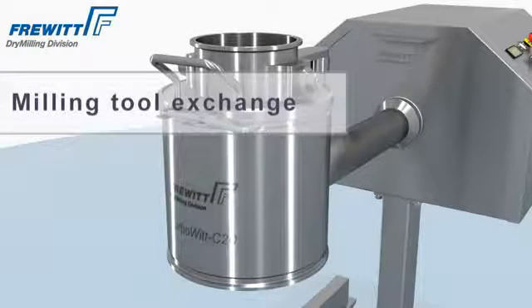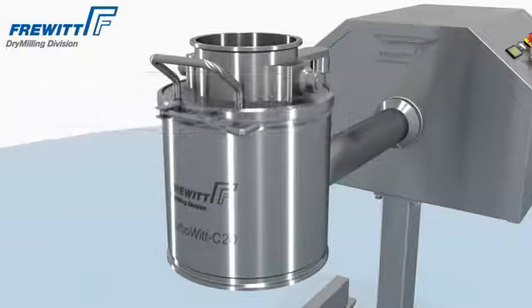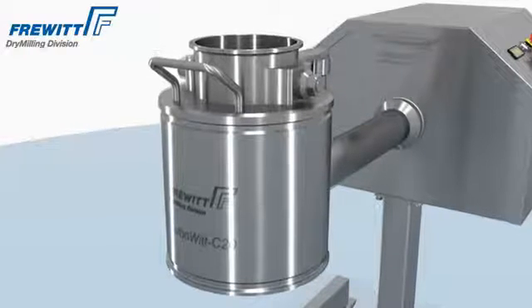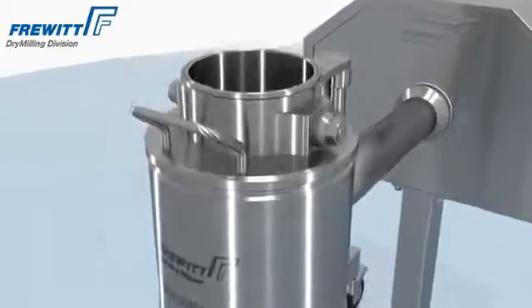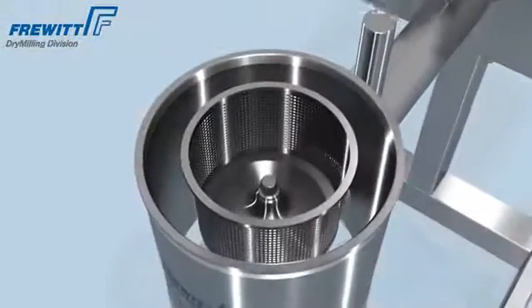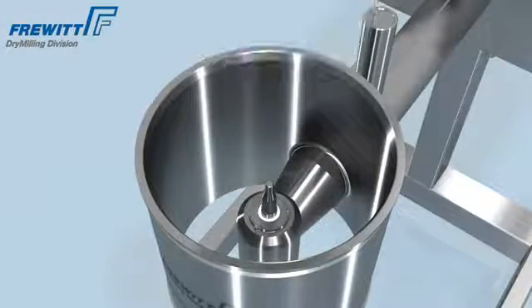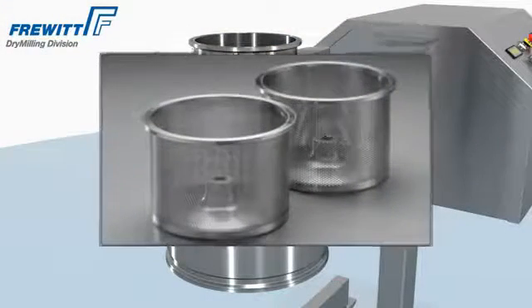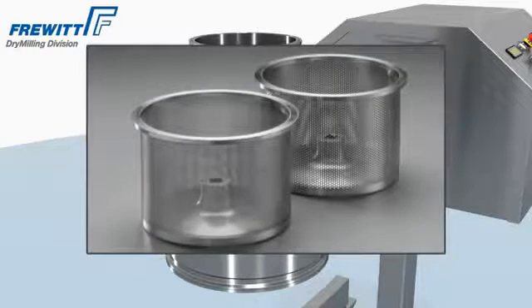The TurboVit mill can be disassembled almost effortlessly. Nearly all your requirements will be fulfilled with a broad range of sieves and stators.